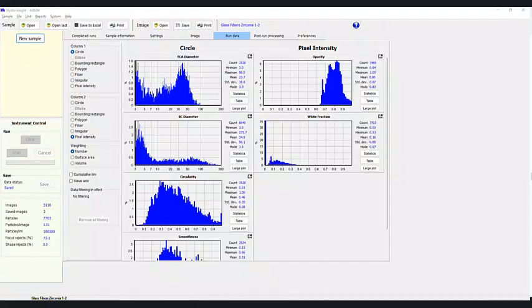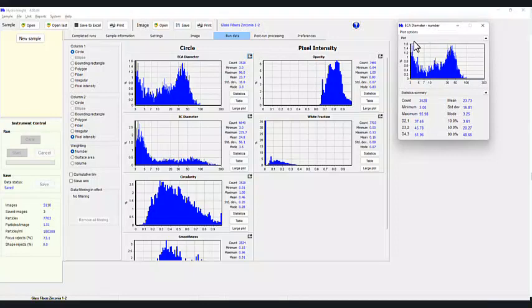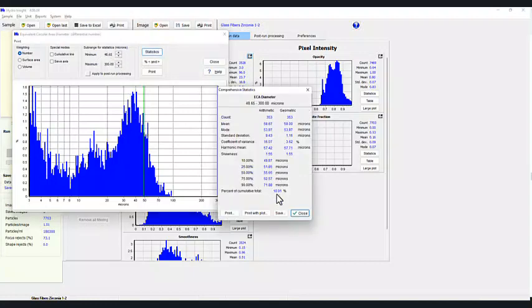All right, here's the first sample that we have. It's a zirconia fiber. So we look at all of the different statistics. Again, this is what most people are accustomed to looking at when they do a particle size analysis. They're accustomed to looking at either a number weighted distribution or a volume weighted distribution. One of the benefits of a number based technique is that we can look and see what percentages of populations there are. So, for example, let's say we want to see what these particles were greater than, let's say, 48.6. We can look at the statistics to see what that amount was.